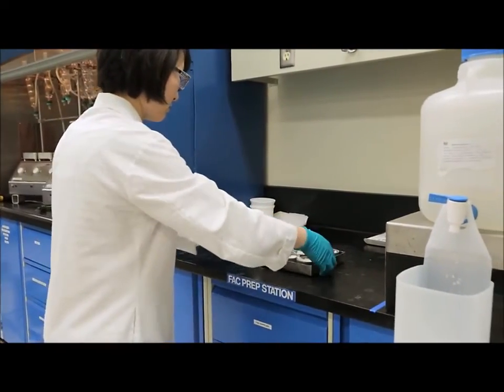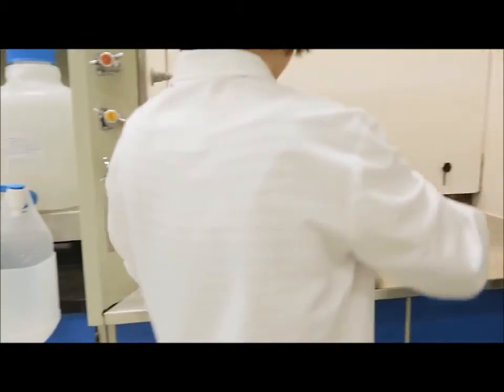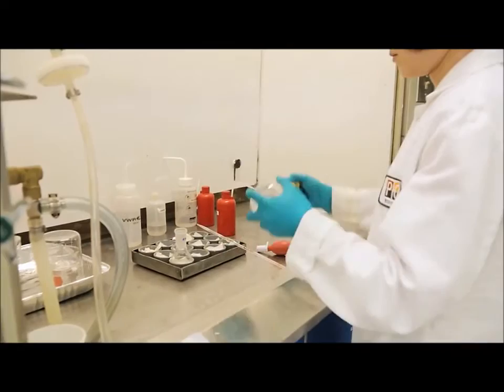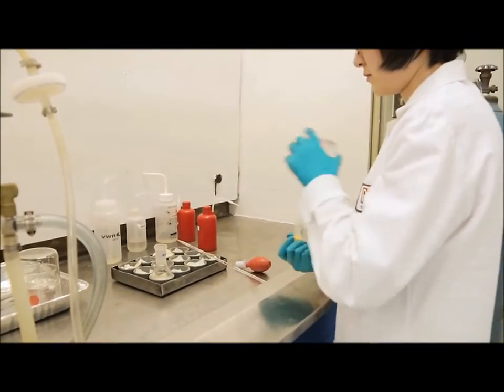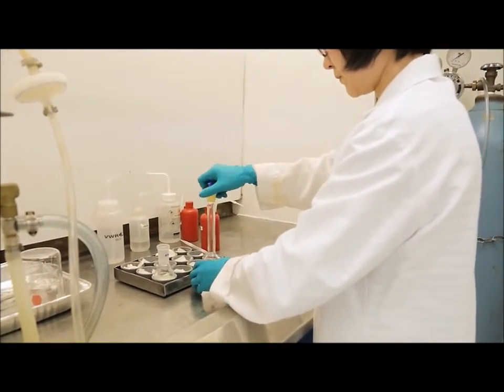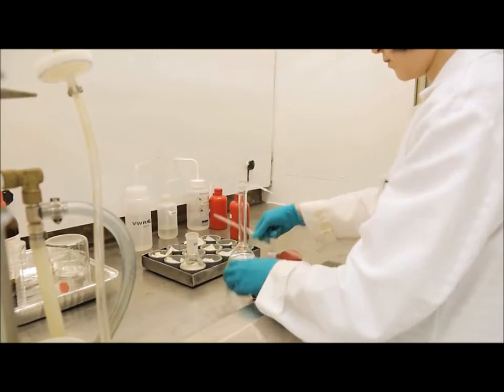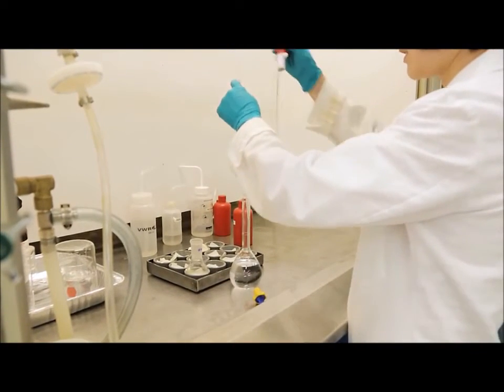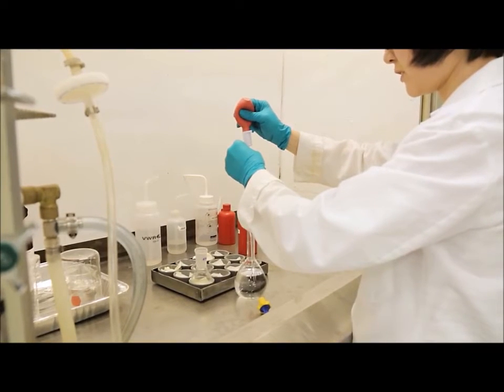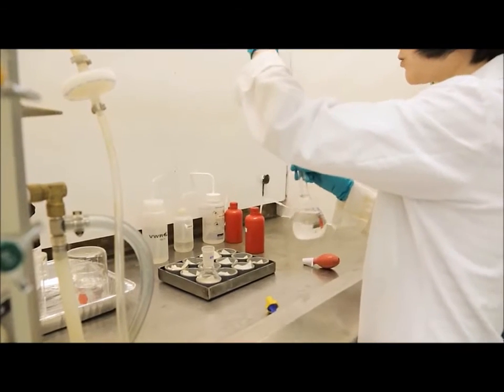The next step will be adding our internal standard to the flask. For the internal standard, we use C21 that is made up in heptane. This is made up once a month and is stored in the fridge. It is important to be as accurate as possible when adding the internal standard and to ensure that all internal standard has been added to the flask from the pipette.